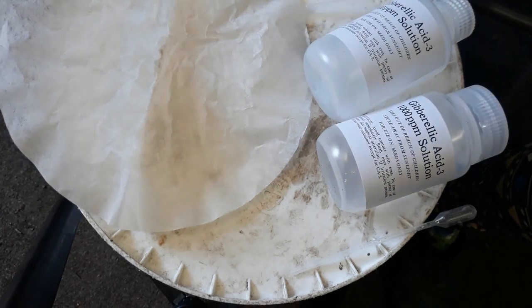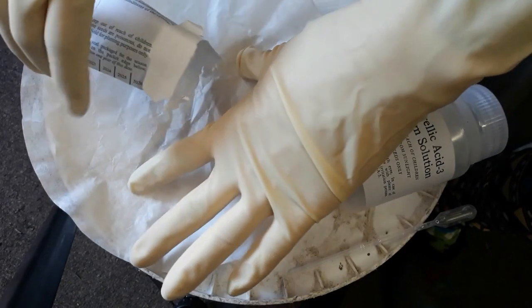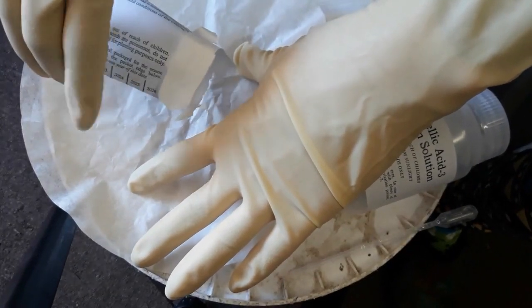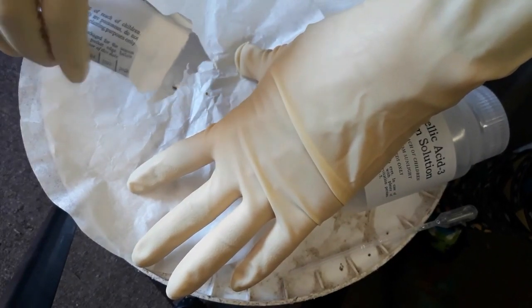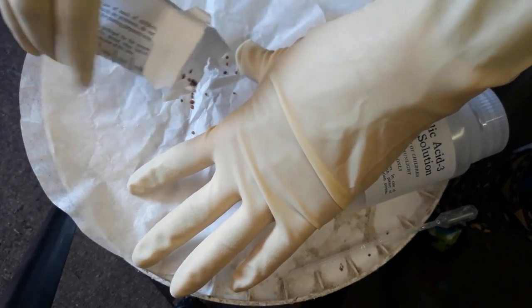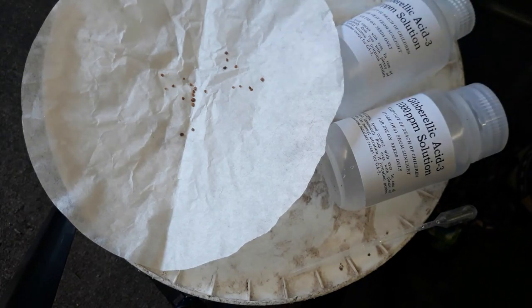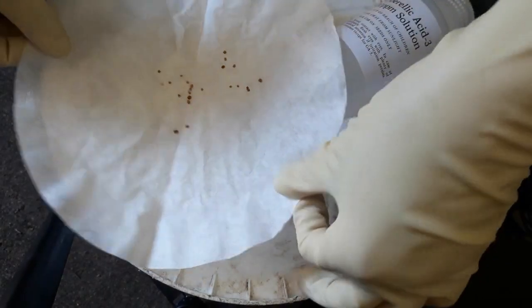Imbibing is when seeds take in moisture. I wanted them all to be taking in moisture for the same amount of time, which is why I started the DI water at 24 hours too. I'll just sprinkle some seeds on here for you to see — these are pretty tiny seeds. I'm not going to worry about counting these ones because I've already counted out the ones for the actual experiment.